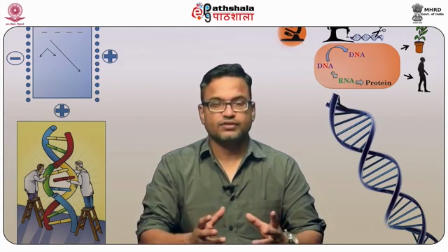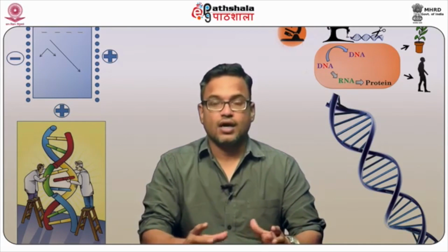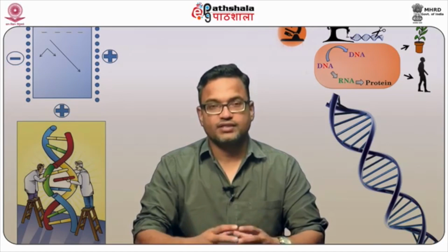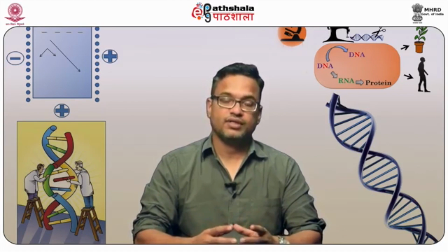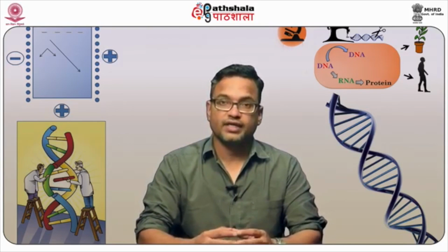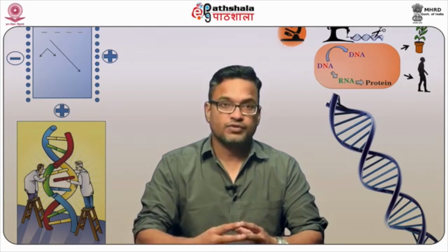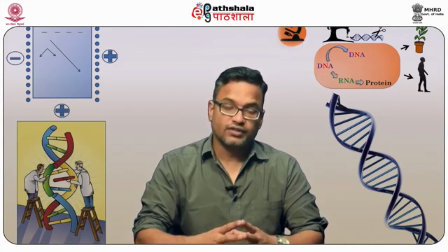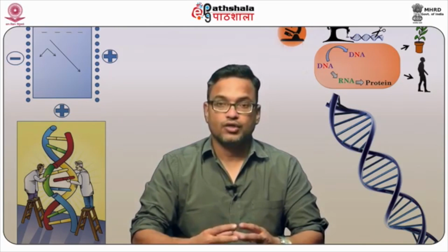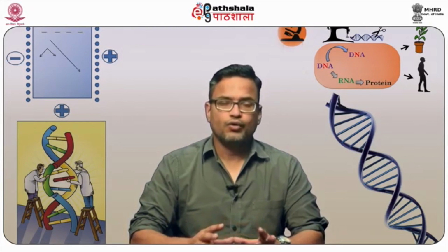So what is a microscope? A microscope is an instrument that allows us to magnify an object. Most of the things which we see through our eyes are in high resolution, but there are several things which we want to enlarge, especially in research. When we're trying to understand how a specific thing is constituted, we require magnification, and microscopes give us that tool, which allows us to magnify a smaller object into a larger image or larger form.